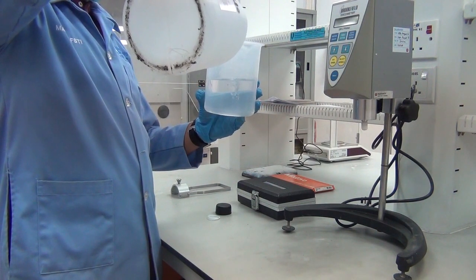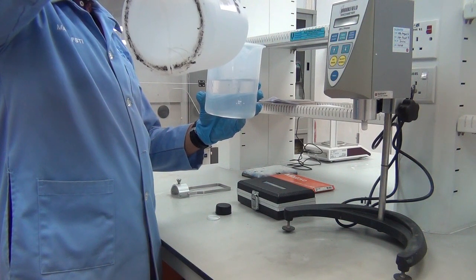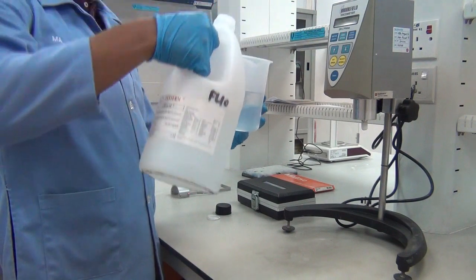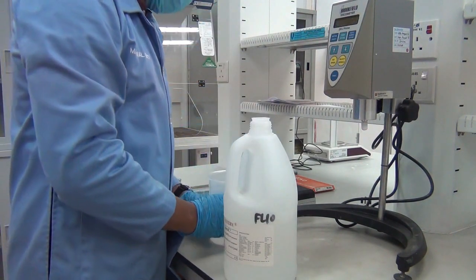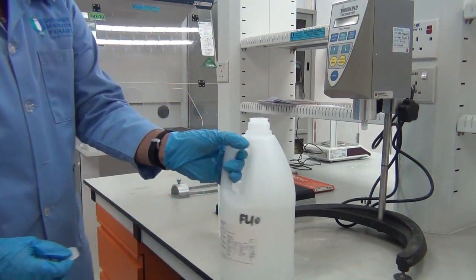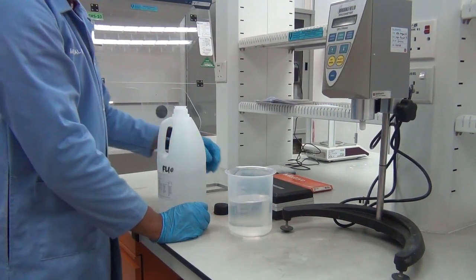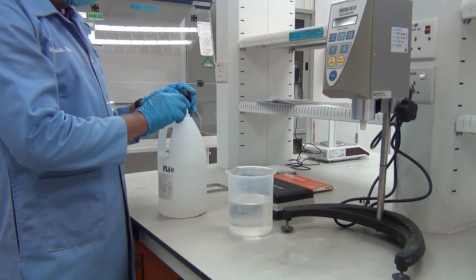In this experiment I will use about 600 ml, making sure it is above 500 ml. We believe this volume is enough to measure the viscosity of the material.